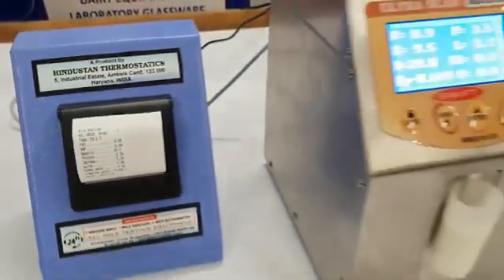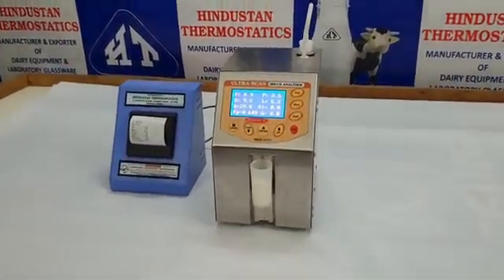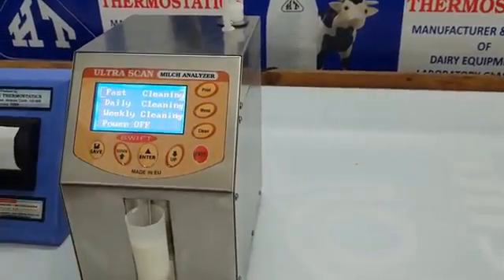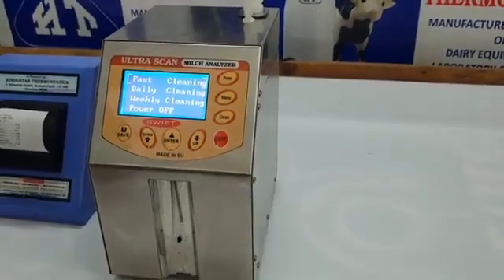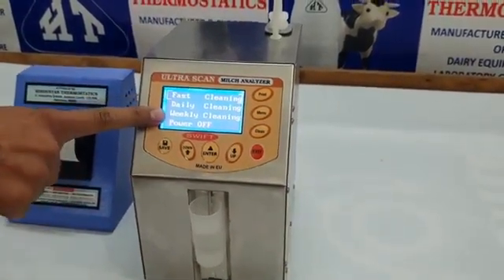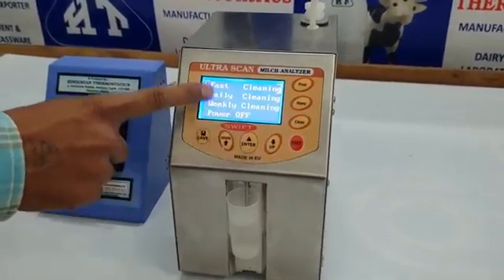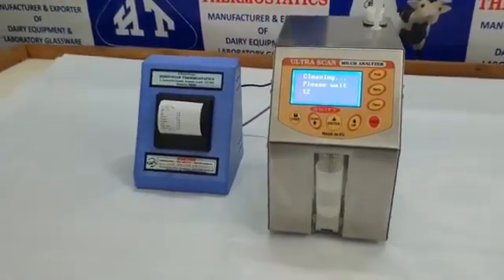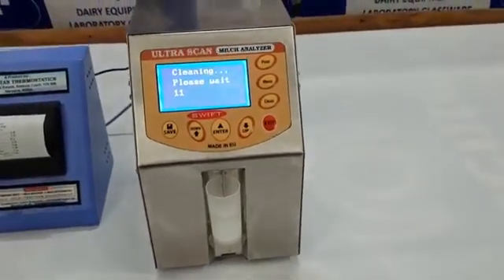When the session is over, the machine needs to be cleaned. There is a single-click cleaning option on the keyboard. Just click the button and select the type of cleaning: fast cleaning, daily cleaning, or weekly cleaning. Press Enter to start and the whole machine will rinse automatically. This rinse cycle can be adjusted in the settings.